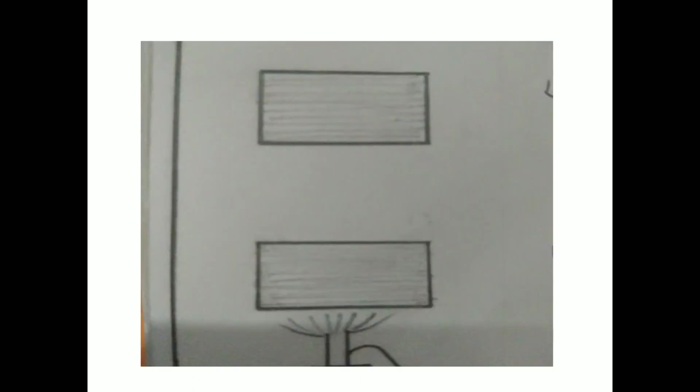Here we pass the slide over the flame two to three times after the drying, so that the bacteria get fixed on the glass slide. In that way the bacteria get fixed on the slide.